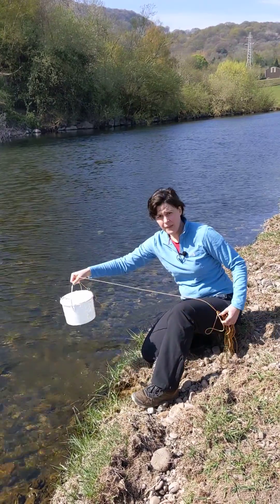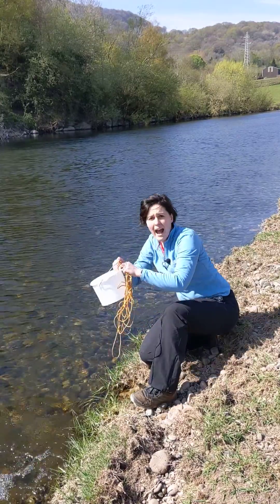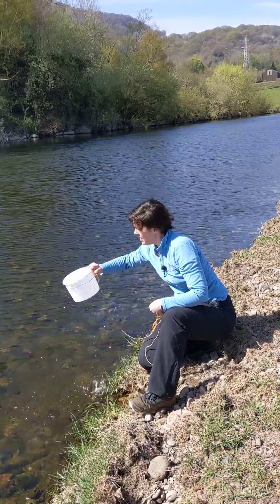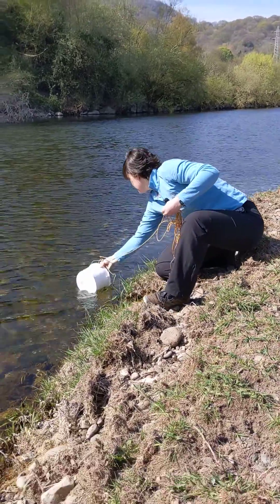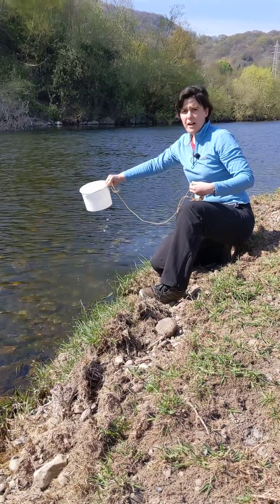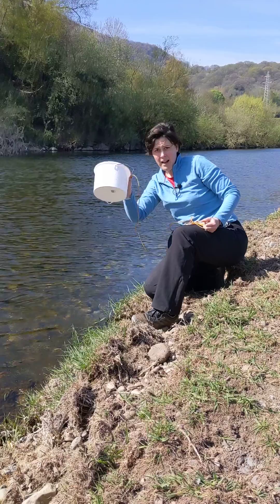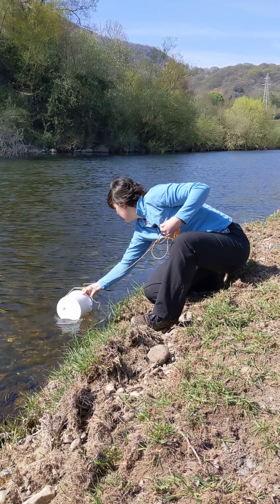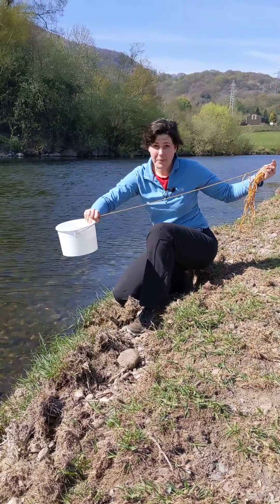Dunk it into the water and give it a swirl round, then empty it out downstream. Another swirl round, empty it downstream. And then a final third swirl round, empty it downstream. Now you're confident that your sampling bucket is sufficiently clean, and you'll be able to collect your sample and bring it up to the bank for analysis.